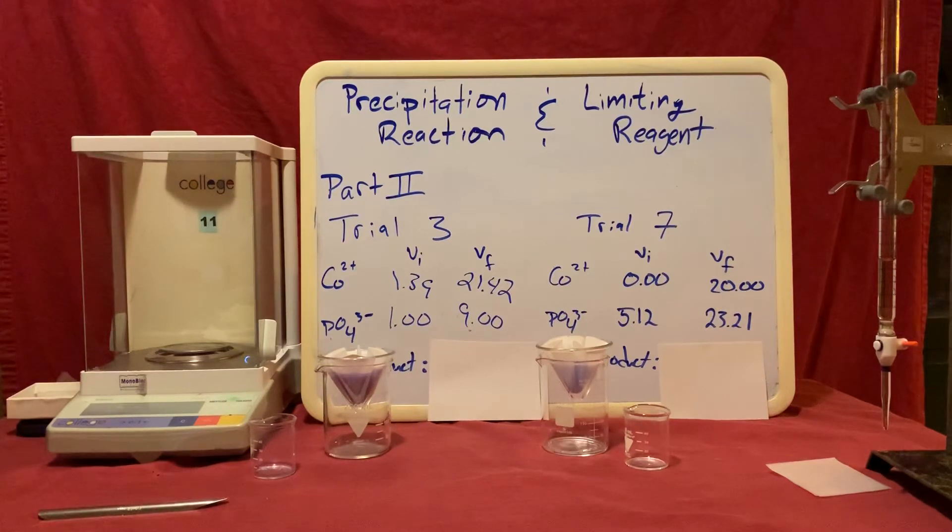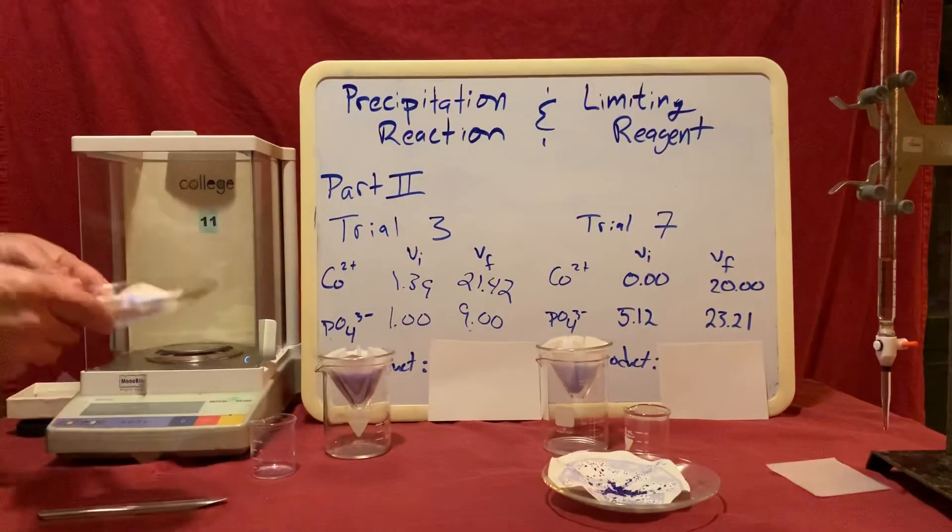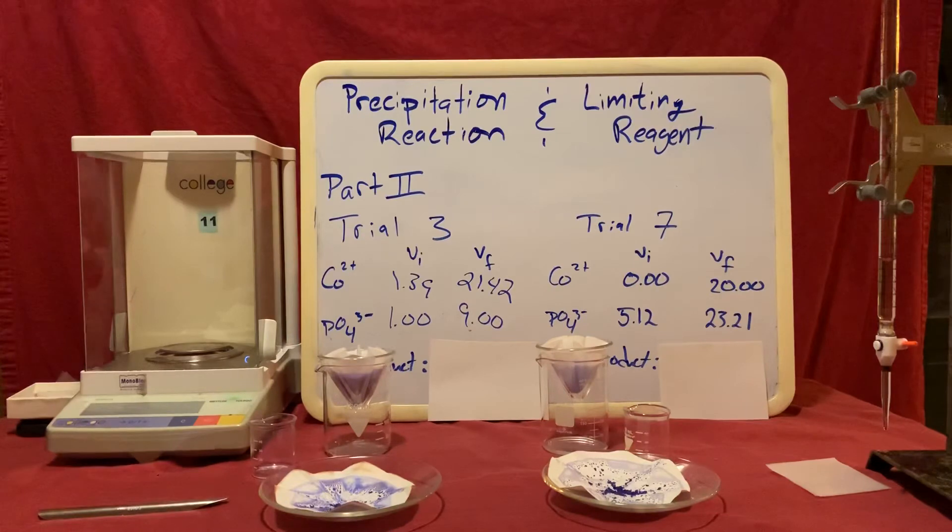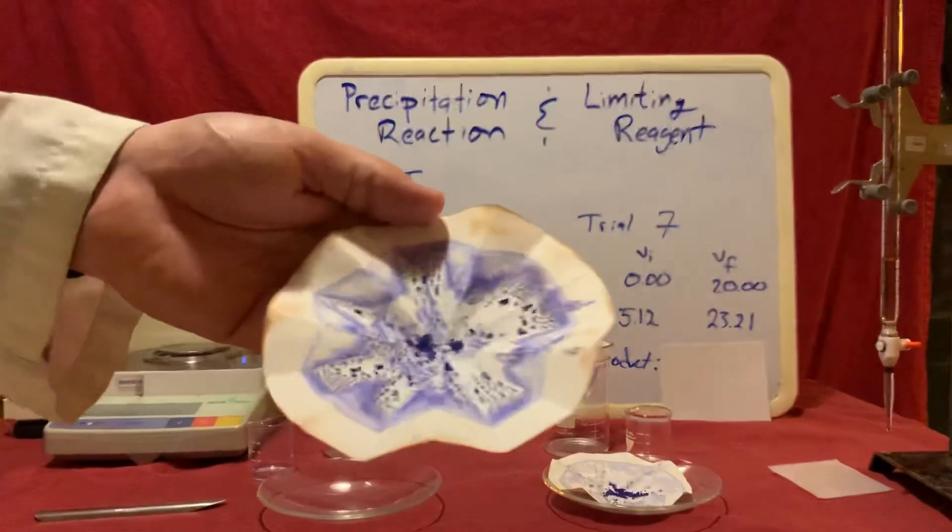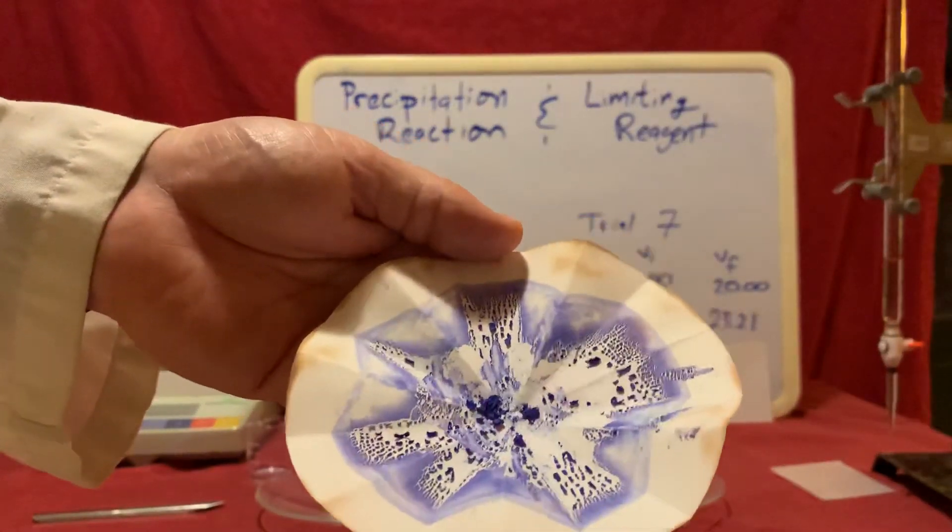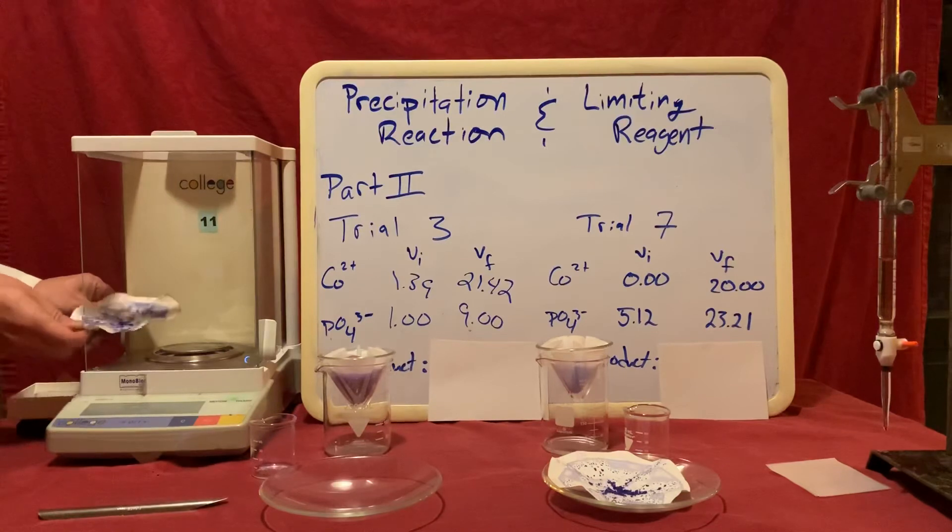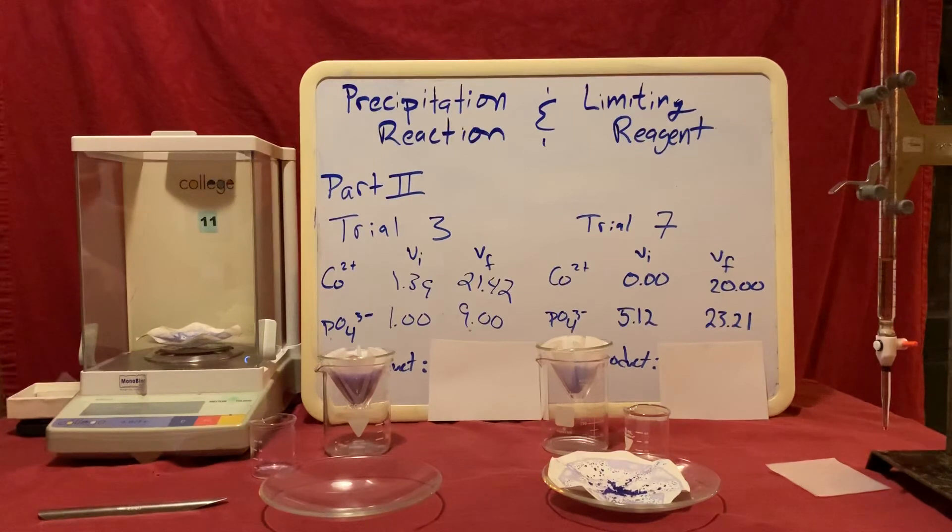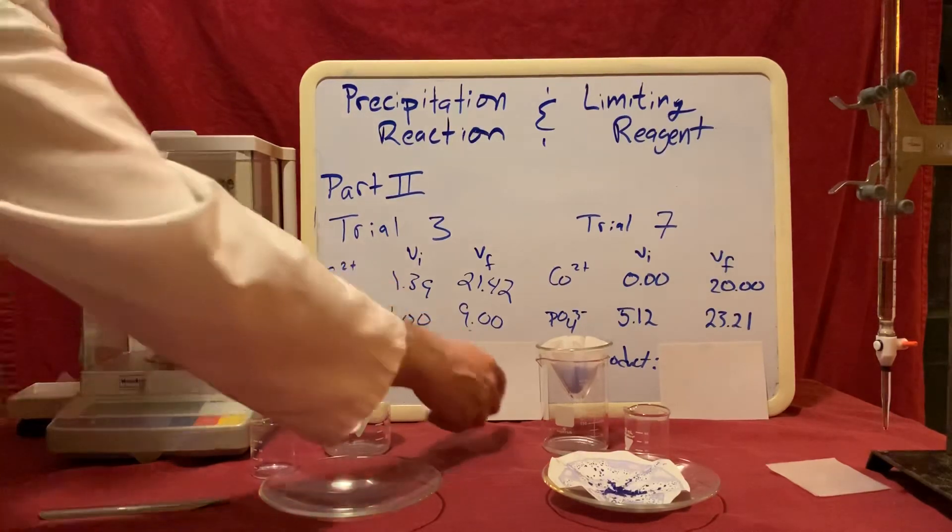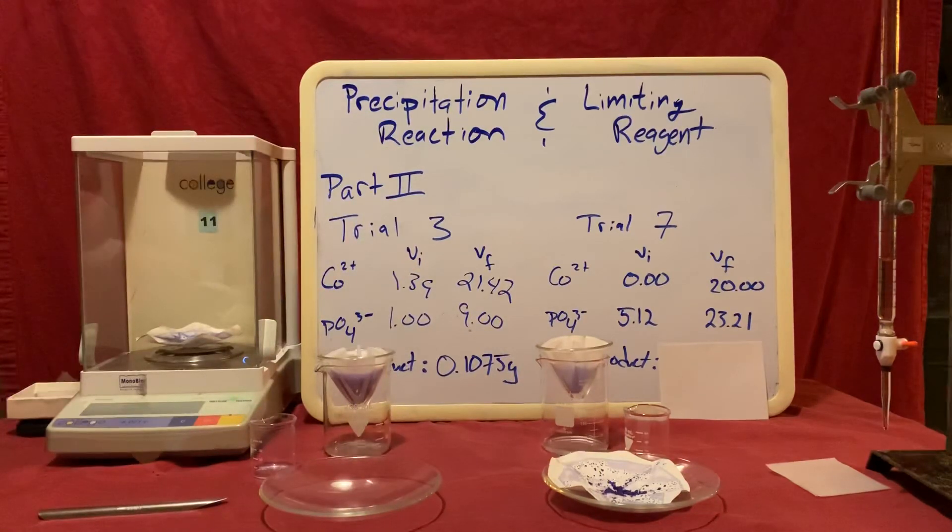Now, because that too takes some time, I have prepared both a trial 7 and a trial 3 example. You can see here my trial 3 example, I now have a nice dry solid. I would take this, place it upon the balance, note my total mass, subtract the mass of the empty filter paper, and determine the mass of my product. In the case of trial 3, I managed to get a yield of product of 0.1075 grams.